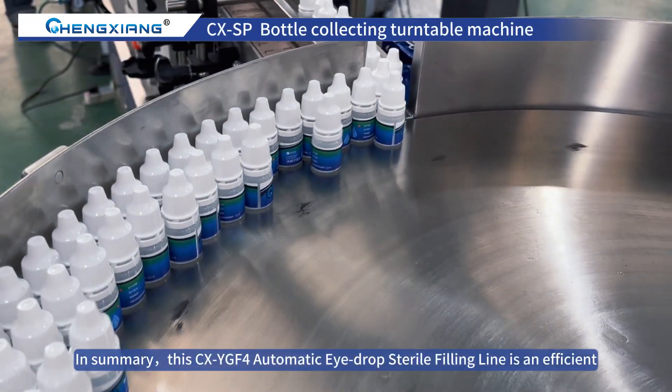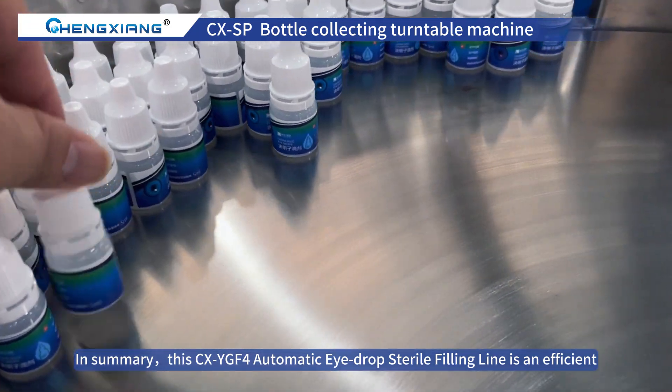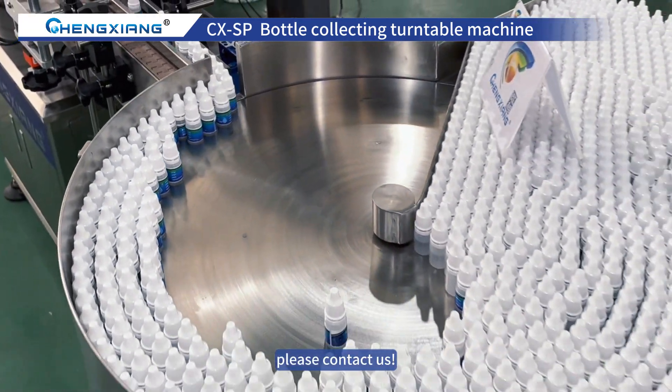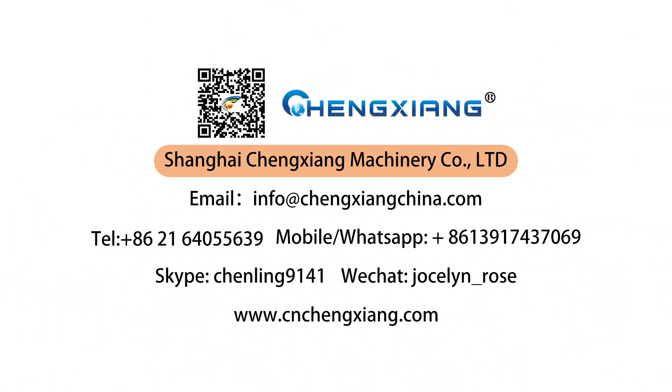In summary, this CX-YGF4 Automatic Eyedrop Sterile Filling Line is an efficient, stable and safe mechanical product. If you want to know more, please contact us. Thank you for joining us.